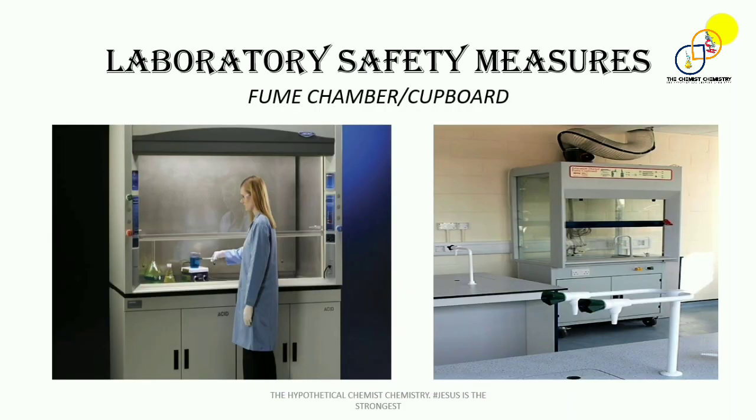Now, this is a picture of the fume chamber or cupboard. So, see this lady there performing an experiment in the lab, and if you look at the picture very well, especially this side, you could see fumes there. When these fumes come out and she inhales them, it can even cause suffocation.